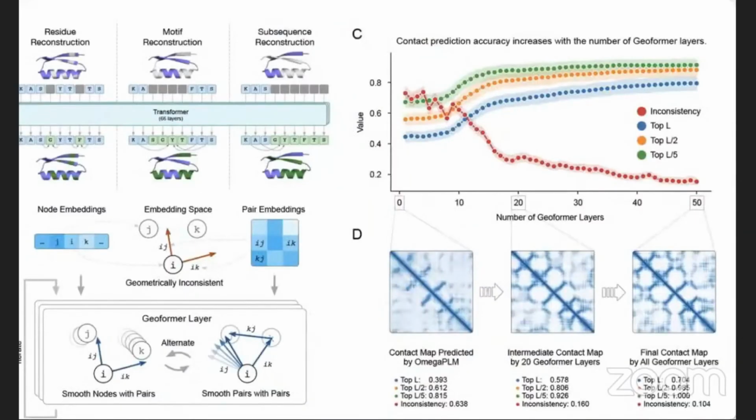Then about the comparison, the understanding of what the different models are that are really at par on CASP, the recent CASP, where there was a competition and people were checking accuracy. The new model developed by Helixon, they claim, outperforms RoseTTAFold. Another important software in structure prediction is RoseTTAFold, which is widely used and achieves similar prediction accuracy to AlphaFold 2 on the recently released structures. In the study, the researchers said that they used a new combination of protein language models that allows them to make predictions from a single sequence, using a geometry-inspired transformer model trained on protein structure.